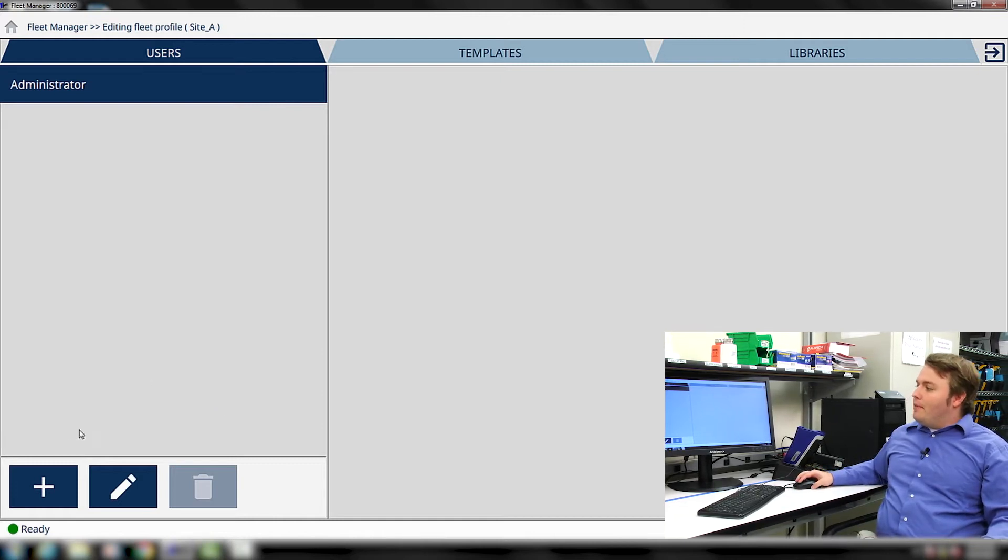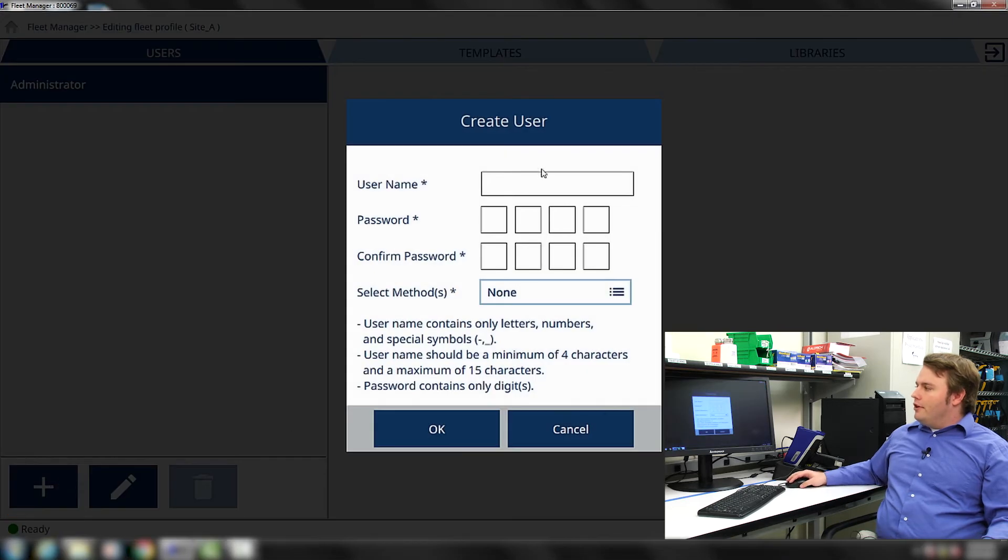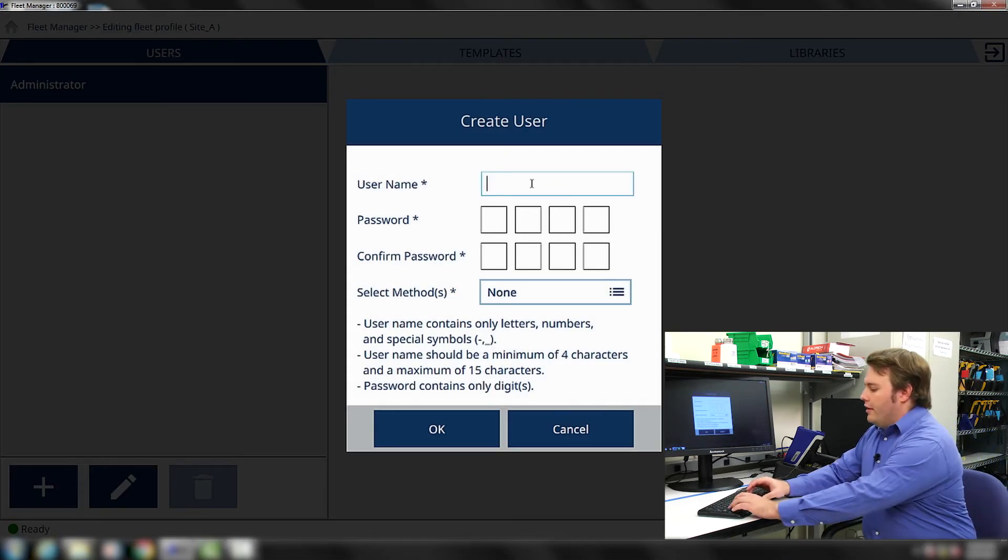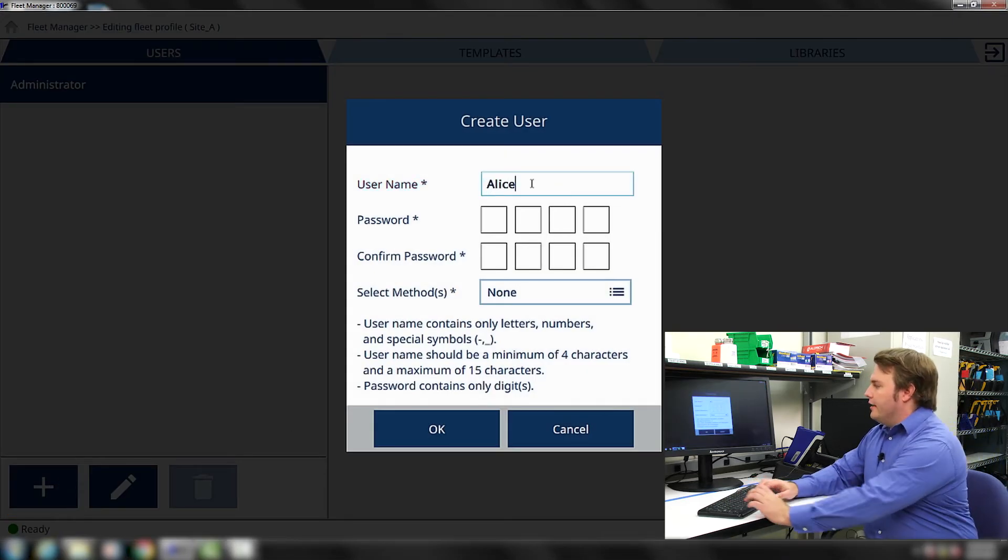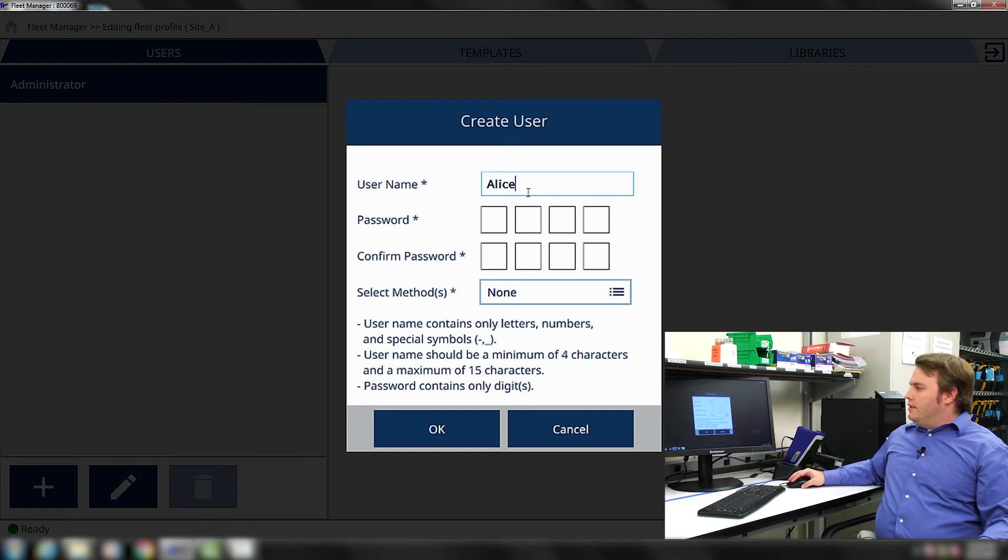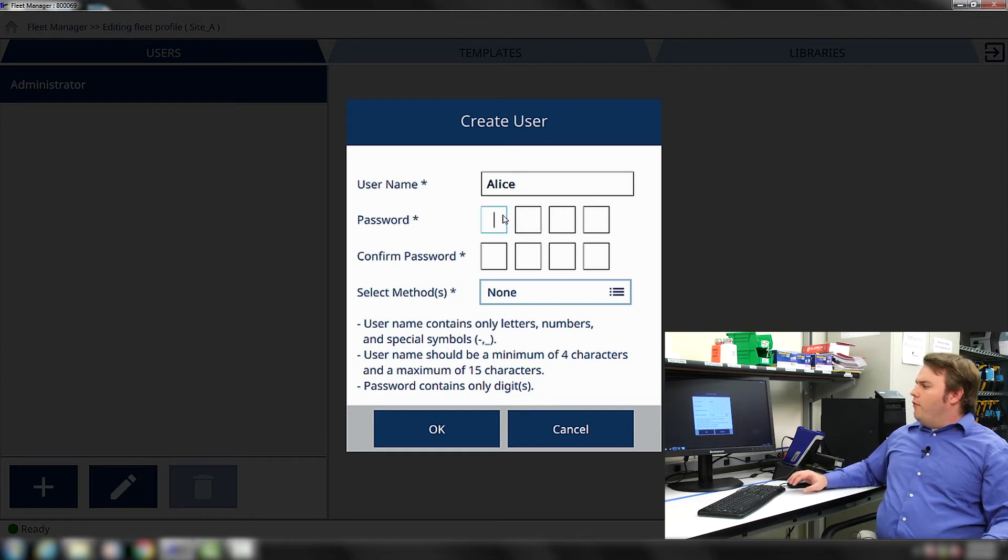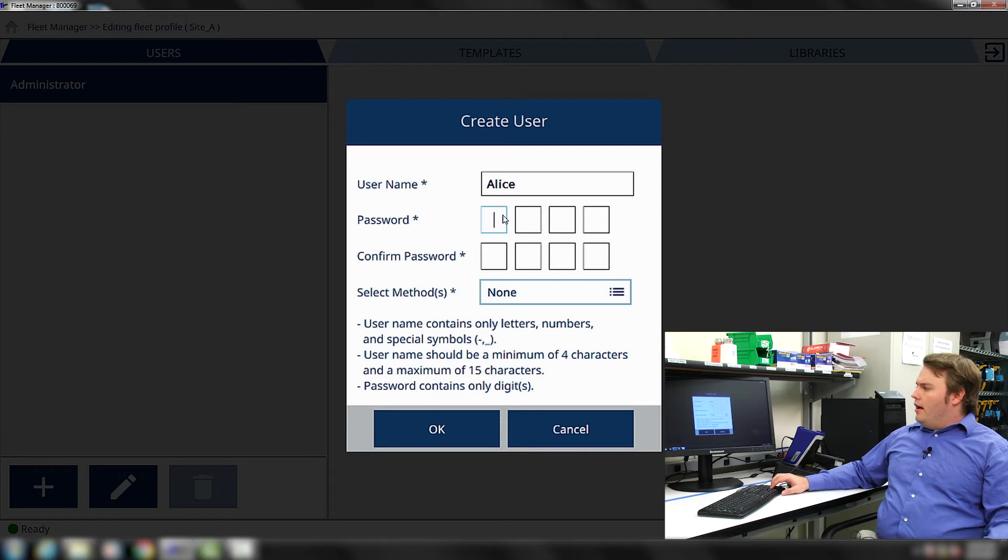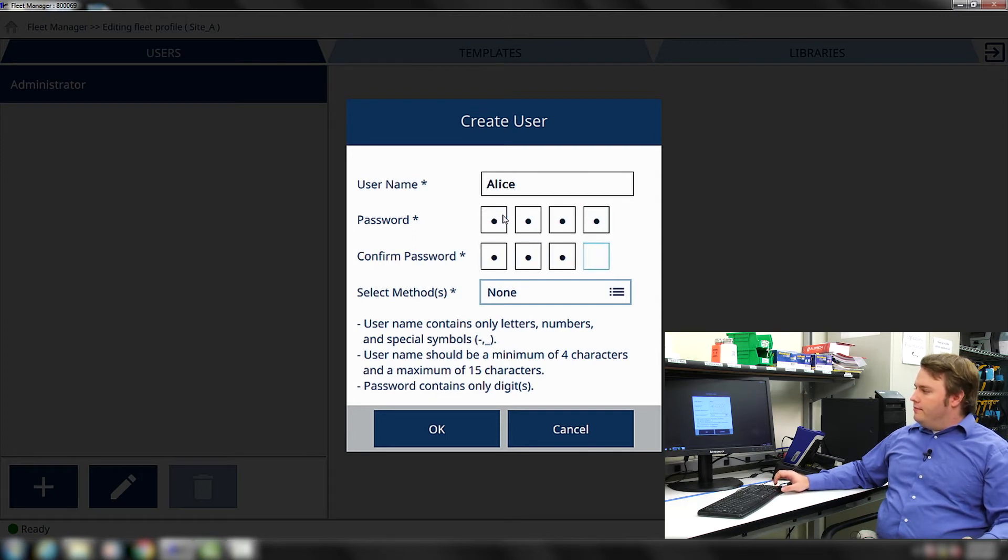We do that by pressing the plus icon in the bottom left-hand corner. We're going to create a user for Alice. We have to create a four-digit numeric password and then confirm it in the Confirm Password field.